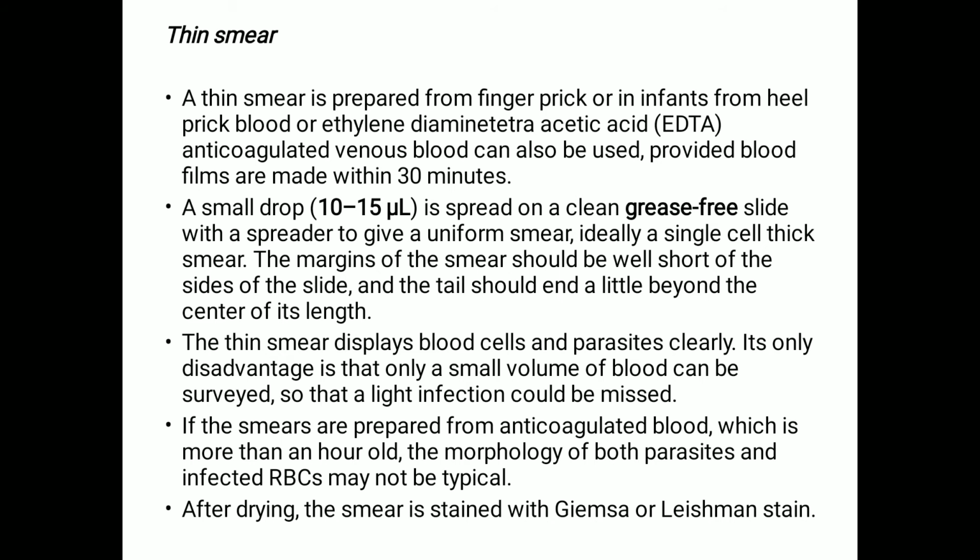Then after drying the smear, it is stained with Giemsa or Leishman stain. For Giemsa stain, the smear is fixed in methanol for 3 to 5 minutes. After drying, Giemsa stain diluted 1 drop in 1 ml of buffered water, pH 7 to 7.2, is applied for 30 to 45 minutes. Then the slide is flushed gently with tap water. It is dried and examined under the oil immersion objective.